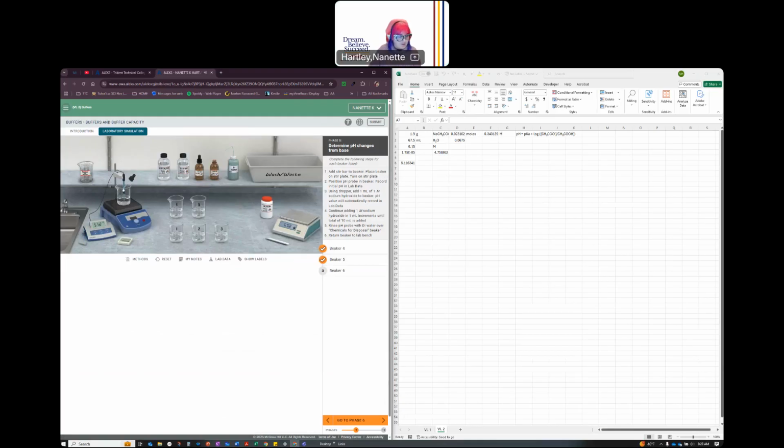1, 2, 3, 4, 6, 7, and 10. Back, taking this out, and then cleaning that off. And then putting this over here. To the next.